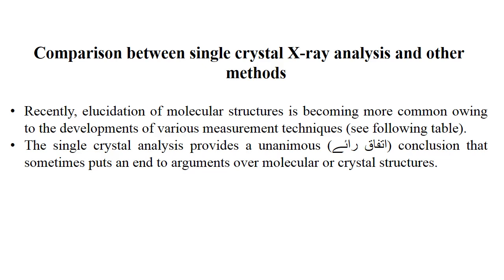In a nutshell, we have NMR, mass spectrometry, and infrared spectroscopy in comparison with the X-ray diffraction techniques.